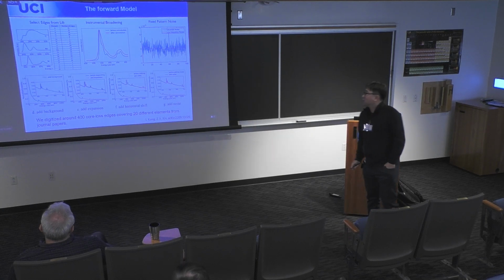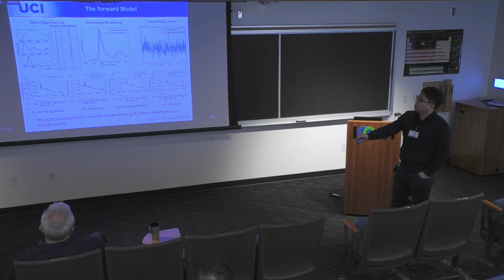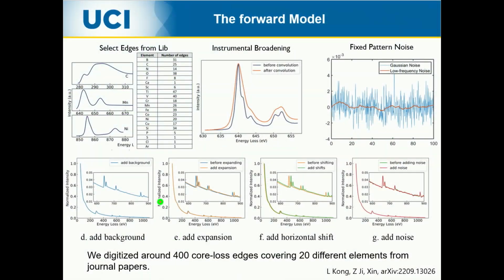So with all of these, we put them on the background, right? All the power laws, you just get it within a reasonable range. You don't even need to know the theory, just empirically, get a lot of data and find the range of these backgrounds. And basically now I can simulate spectra that almost look like real experimental EELS data.